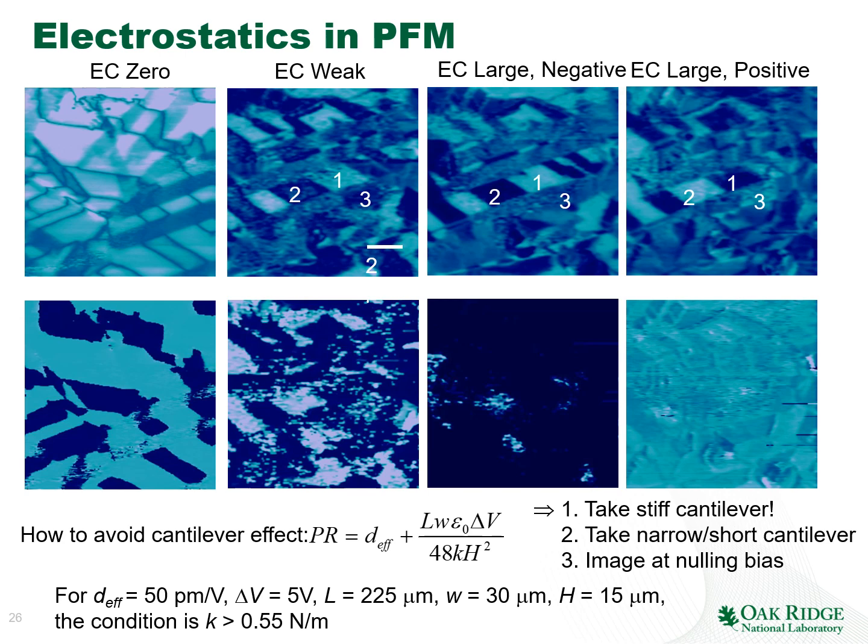So everything that is stiffer than half Newton per meter will give you a pure electromechanical contrast. If your cantilever is softer than half Newton per meter, then the electrostatic contribution can be important.